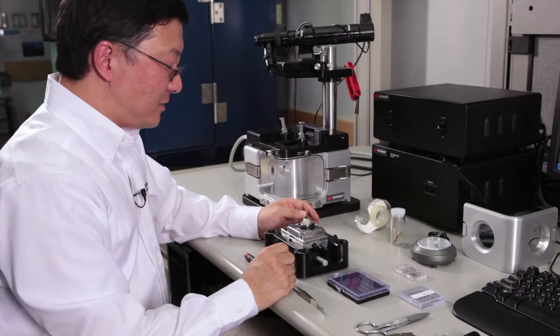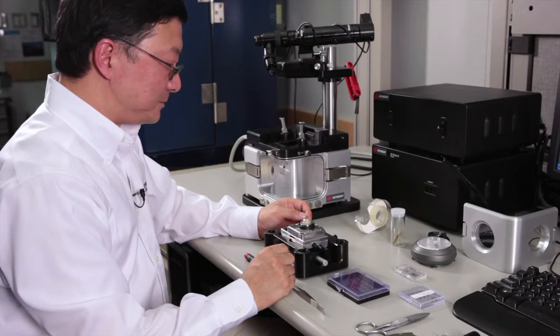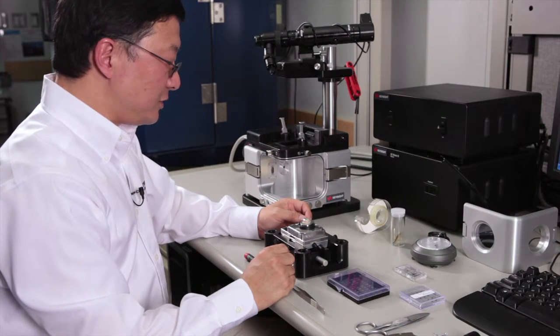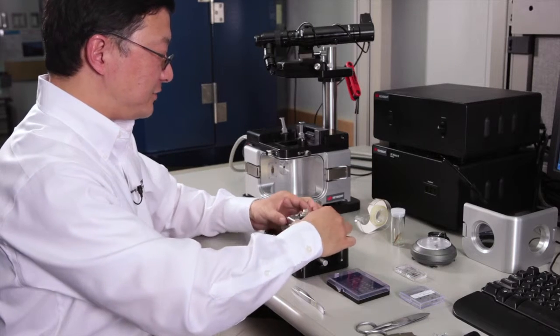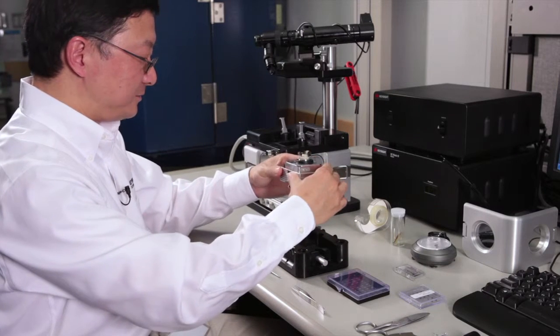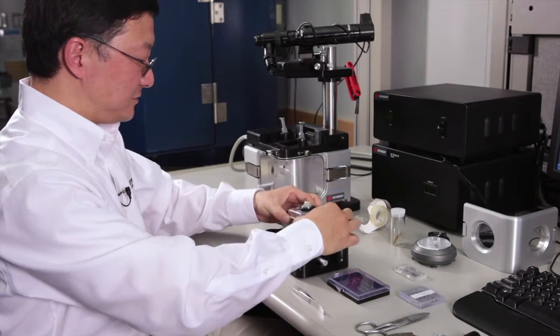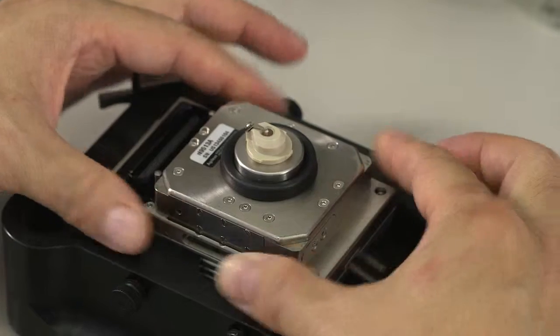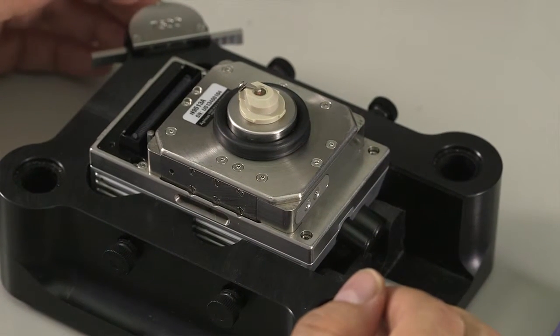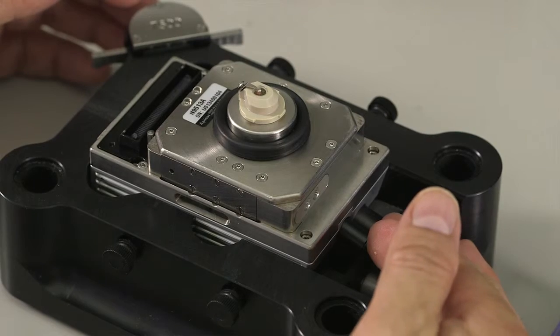So next is to mount the cantilever to your scanner. In order to do so, we need to have the AFM scanner mounted on the scanner station. If you are right-handed, you need to have the adjust knob towards the right-hand side.